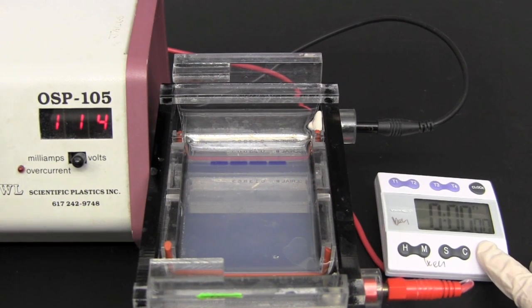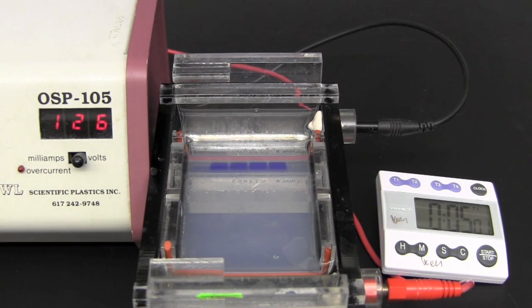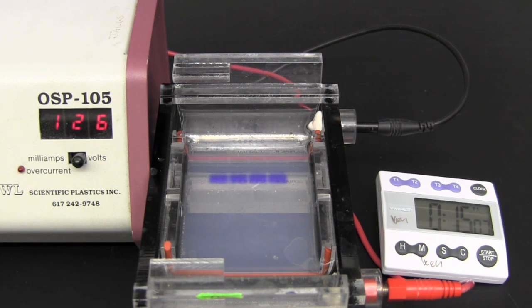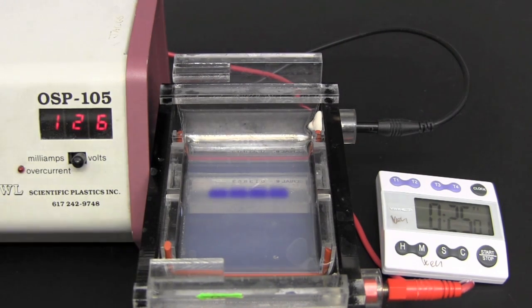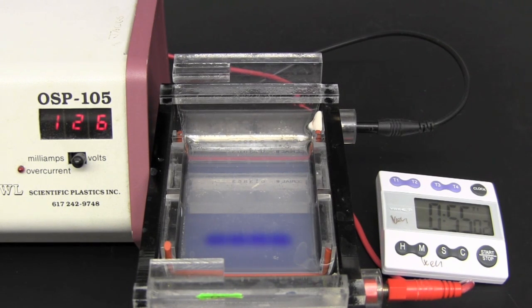Once we turn on the current, the DNA will start moving through the gel towards the positive end as we have explained earlier. Now we have our samples running on the gel. This process usually takes about an hour, but we have sped it up here. The individual bands of DNA cannot be seen when running the gel, but can be visualized under UV light afterward. To make sure the DNA does not run off the gel, we monitor the loading dye, shown in blue, which runs ahead of the DNA and can be seen with the naked eye.